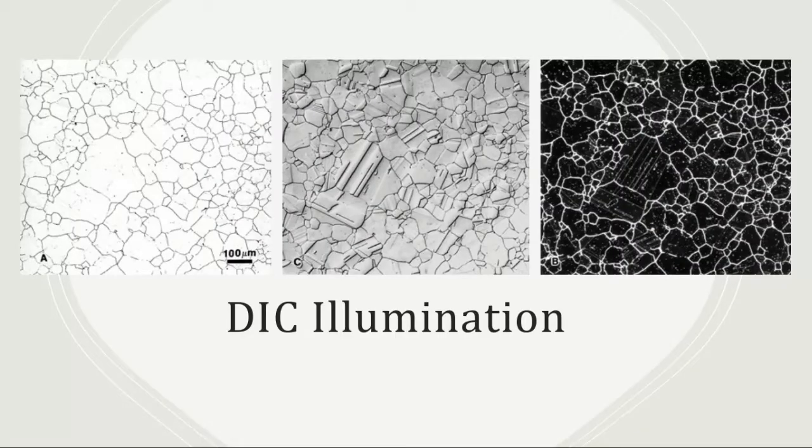So looking at that exact same Waspaloy alloy in bright field, we have dark field, and now we have differential interference contrast microscopy in the center.